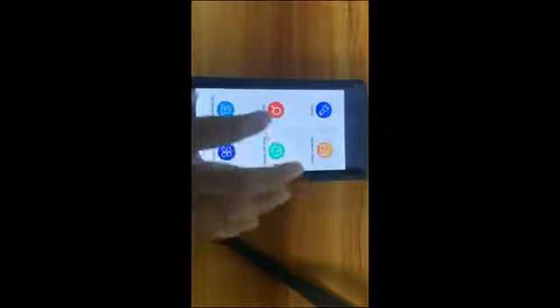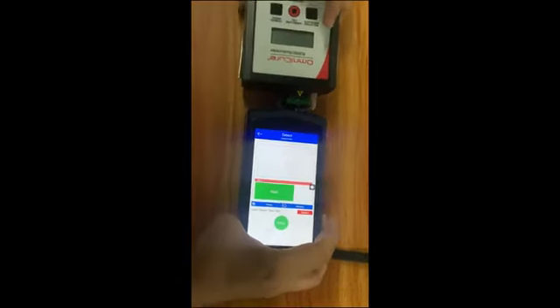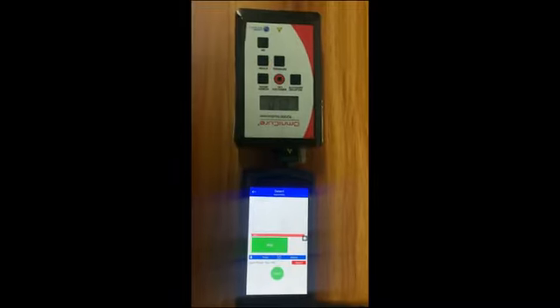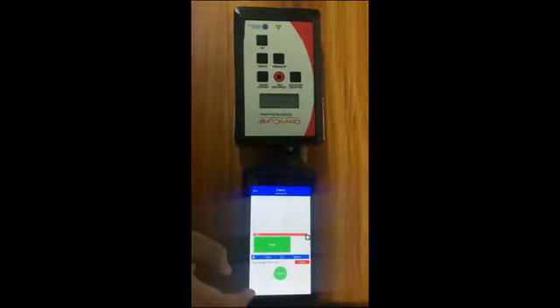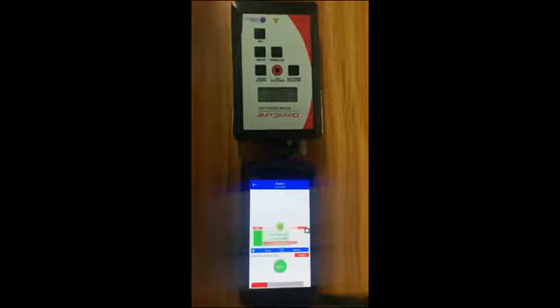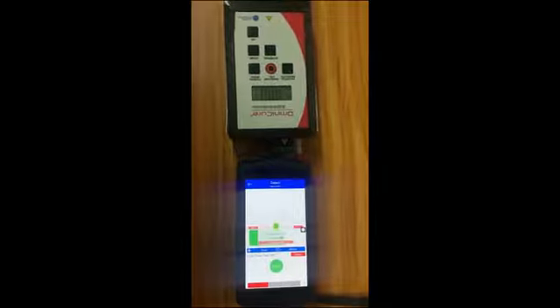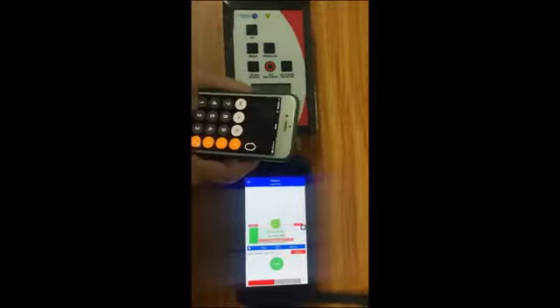Because our power meter is not accurate, you need to multiply by 1.4, and we tested about 100, and you record this. Because the laser power should be shooting for a long time to keep it stable.